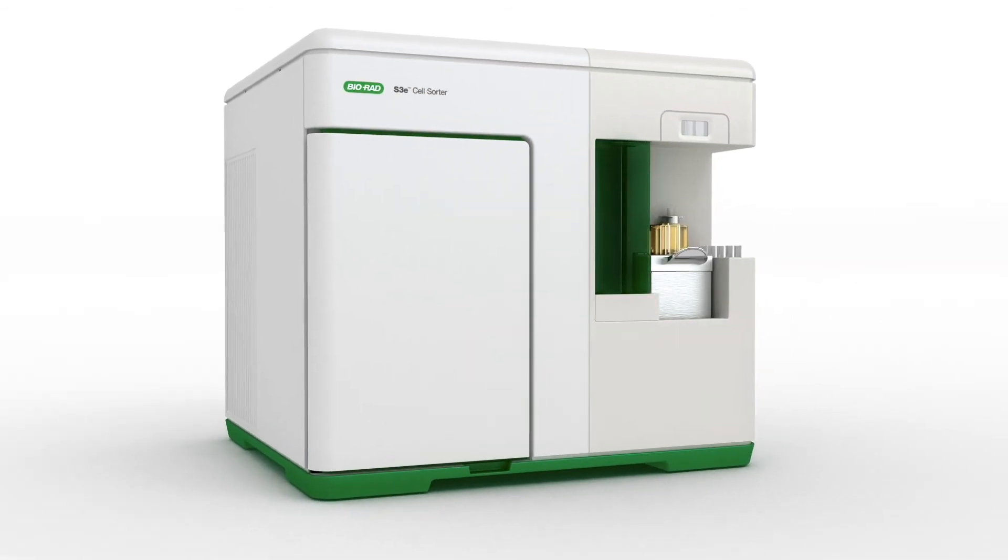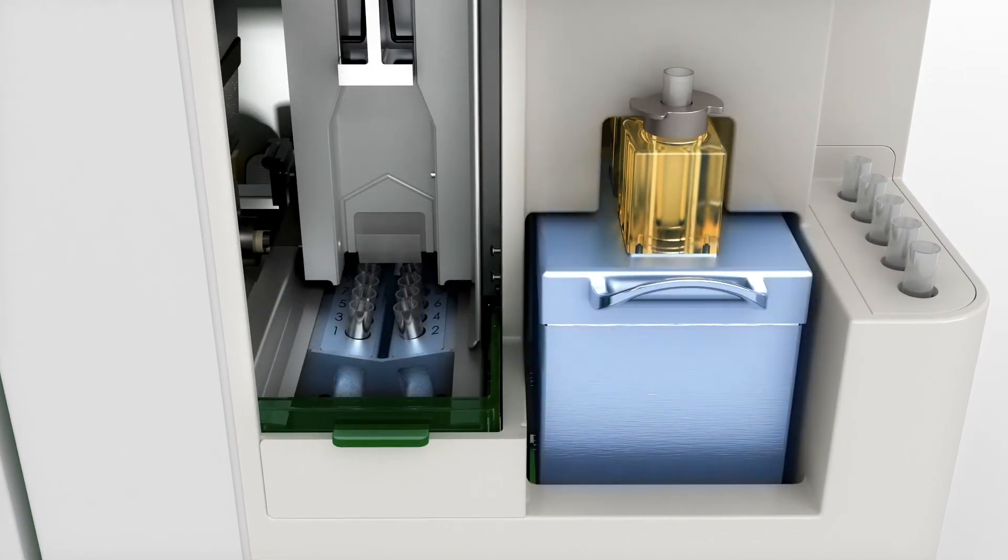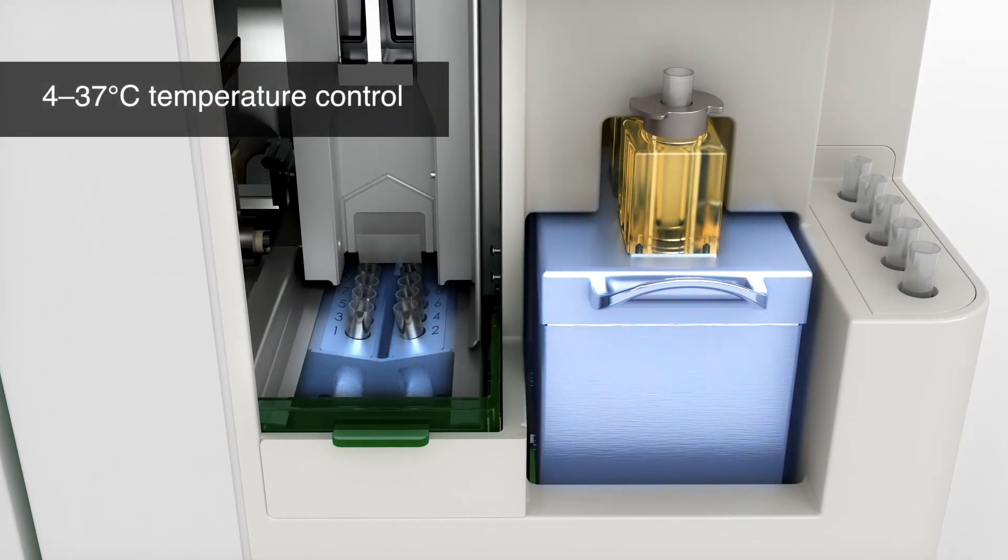The S3E is designed to preserve your precious samples throughout the sort. The sample loading stage and sort collection area can maintain a temperature of 4 to 37 degrees Celsius via a solid-state Peltier system.